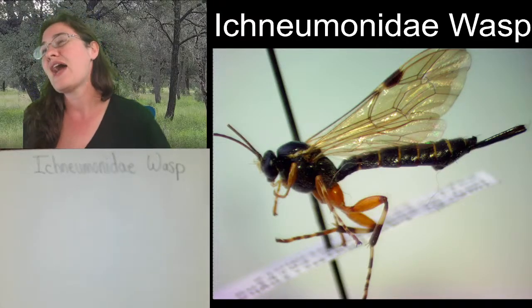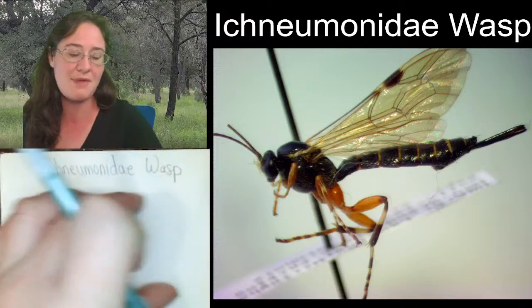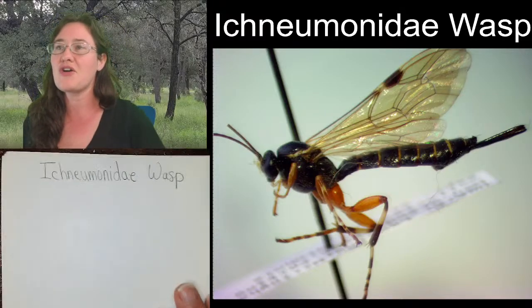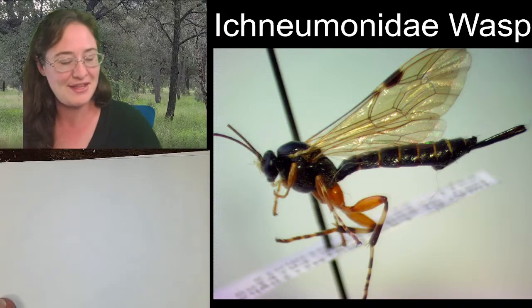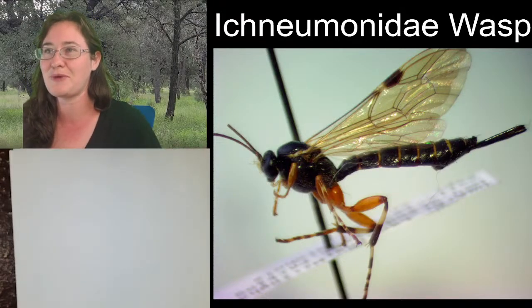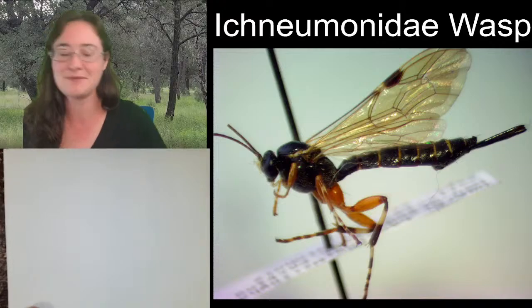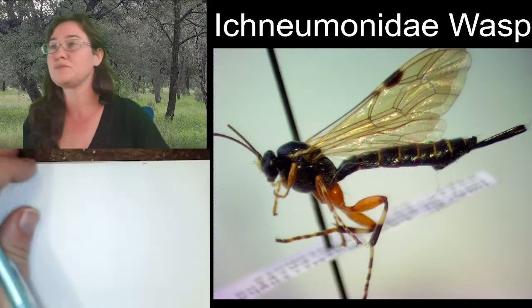All right. So I've got my ichneumon wasps hanging out here. I'm trying to decide if I was going to sketch it on my paper this way, or if I was going to turn it. I think I want to turn it so that I can sketch it a little bit larger. Yeah, that's going to happen. Cool.